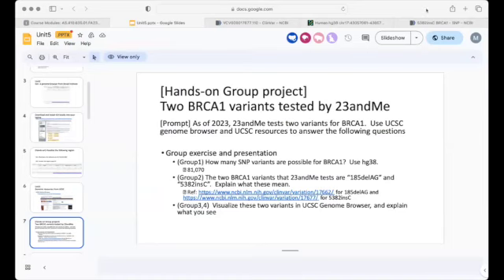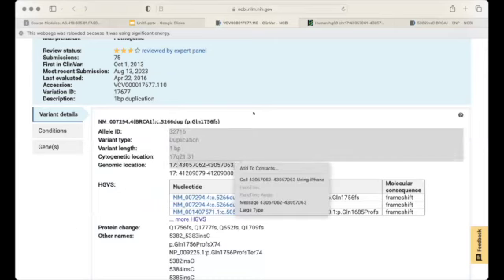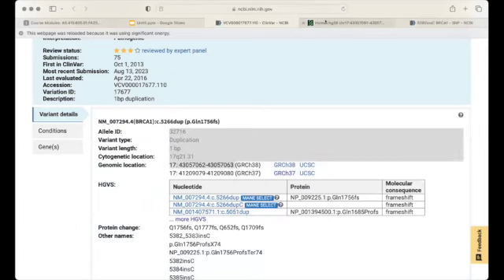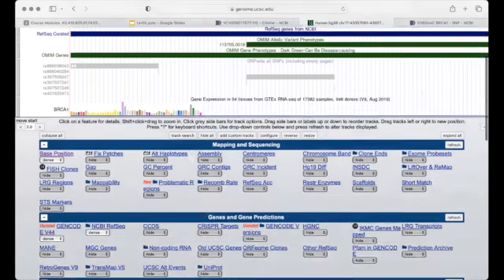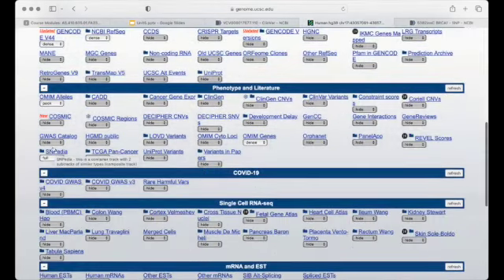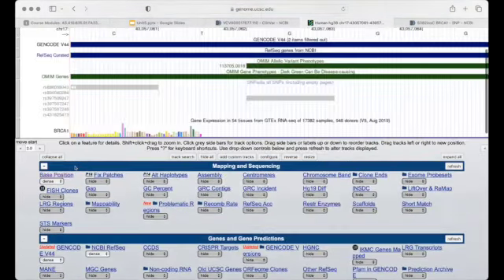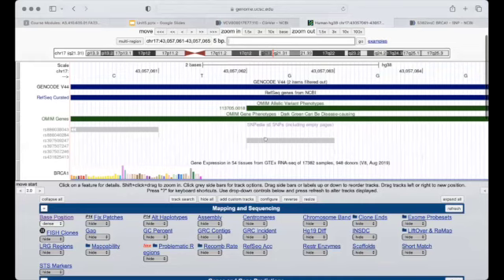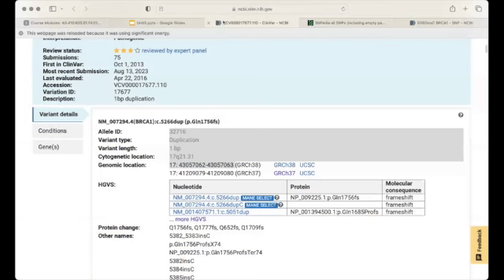It took me to this page and I copied the location, and then pasted that into UCSC up here. Then I included the SNPedia track and the dbSNP 135 track, and this is the location that corresponded. All right, good. Can you show me the first link, the middle tab? Yeah, that one.